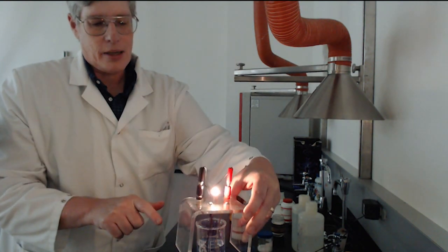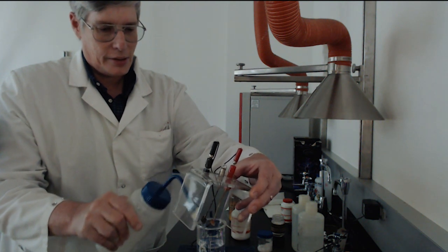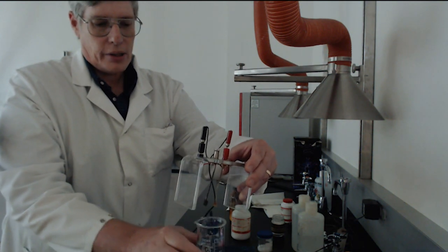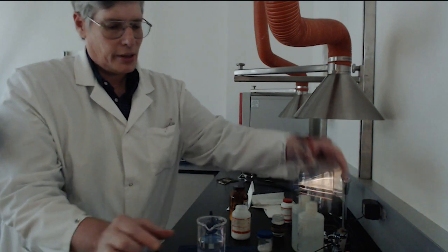One of the cool things about acids, the hydrogen ion is the fastest conducting ion there is, and so you always have higher numbers with acids than you do with normal ionic compounds. So we're going to reference conducting and dissociating completely with hydrochloric acid.